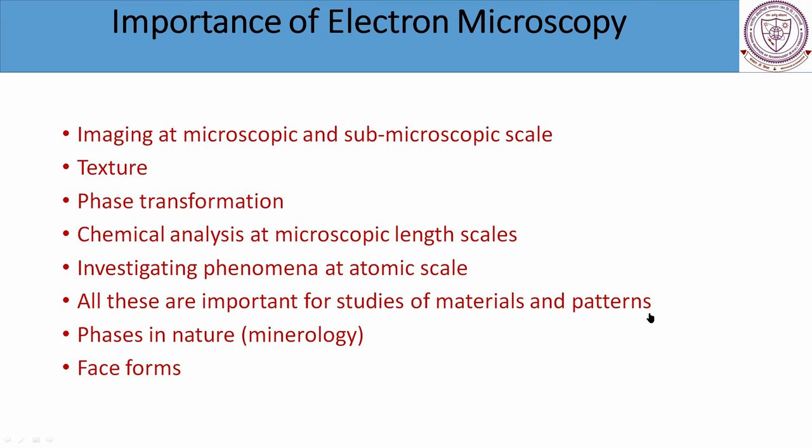This pattern is also very, very important for earth sciences. Even the phases that are present in nature, in the branch of mineralogy that geologists and geoscientists are interested in, they will be able to study. One of the bread and butter of the geologist is the phases of the rocks, and the various kinds of transformation that take place. So phase identification along with phase transformation at different length scales can be studied.